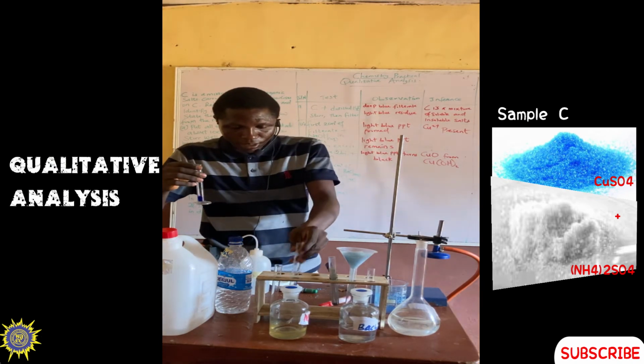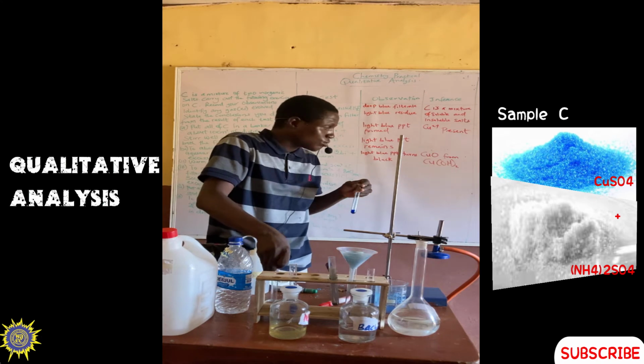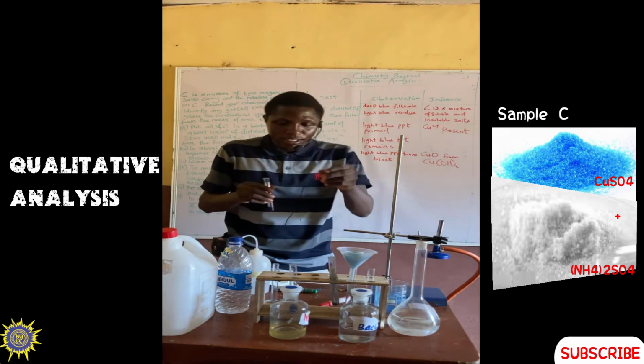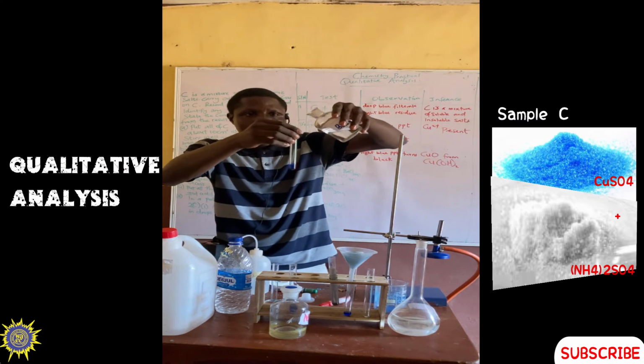So this is another 2 centimeter cube of filtrate. Then we have to add barium chloride to the 2 centimeter cube of filtrate. So when I add barium chloride now, what do we have?